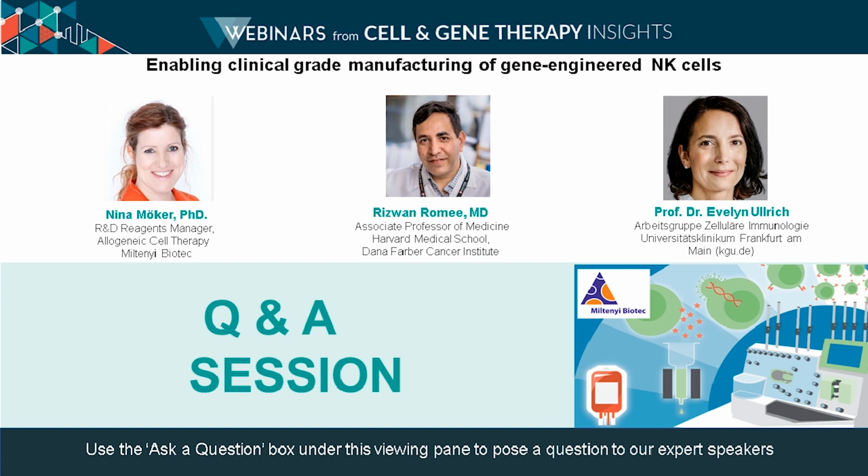But in terms of CAR NK cells, I think the biggest challenge in terms of manufacturing, for translating from preclinical work to clinic, is actually finding a vendor which can make a GMP-grade lentivirus. And if you want to use a baboon-based system, then it is even more challenging, because most of the vendors which make GMP-grade virus don't have much experience with it.